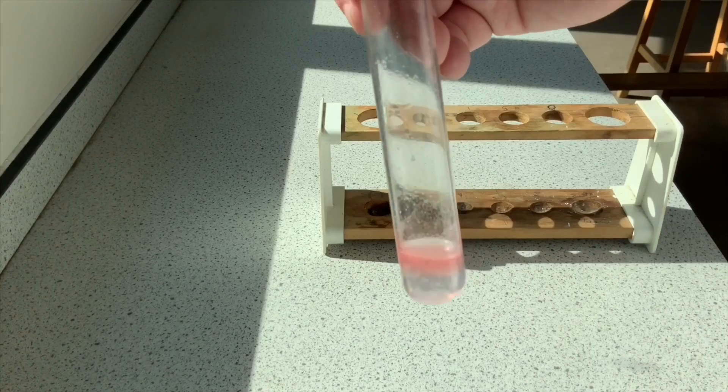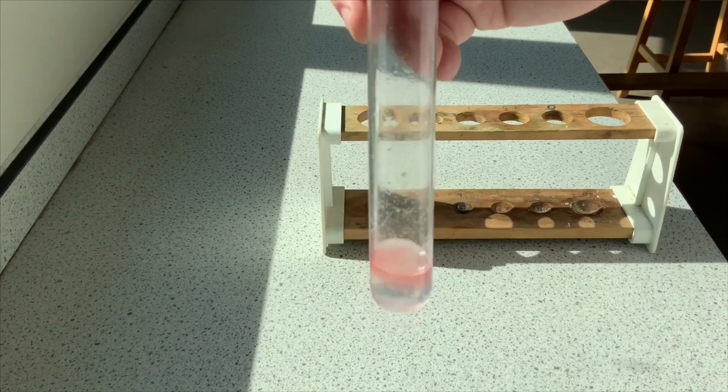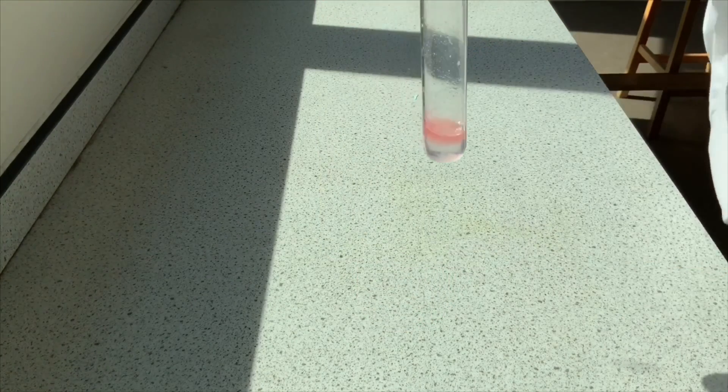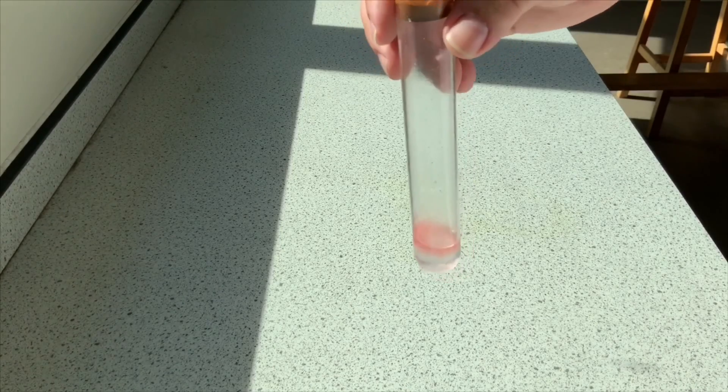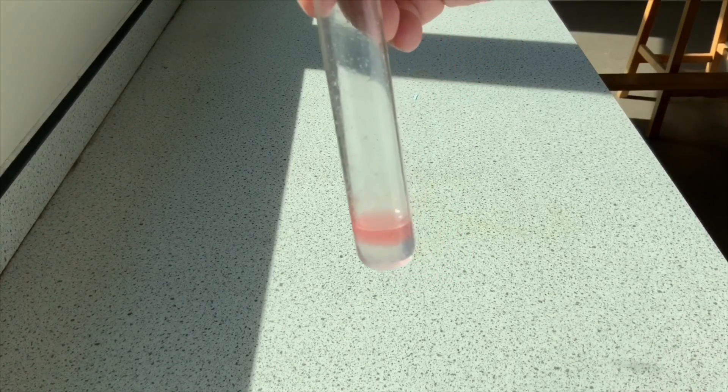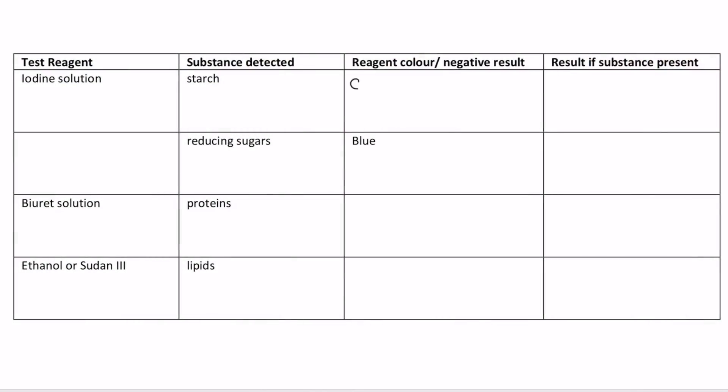So there are our tests. Let's have a look at the table now that you could fill in. There is a worksheet linked to this lesson. First of all, we've got our iodine solution, which detects starch. If we look over here, the original color is an orangey brown, and if starch is present, then we get a dark blue-black color forming.